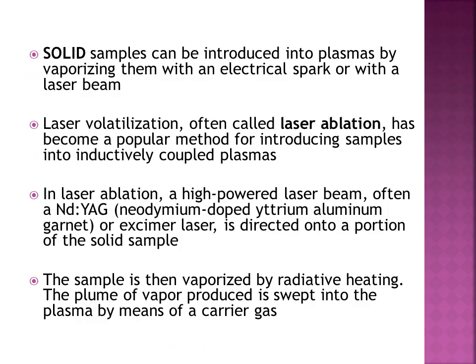Now we will see how solid samples are introduced into atomizers. So solid samples are introduced by firstly vaporizing them, and this can be done by the use of an electric spark or by a laser beam.